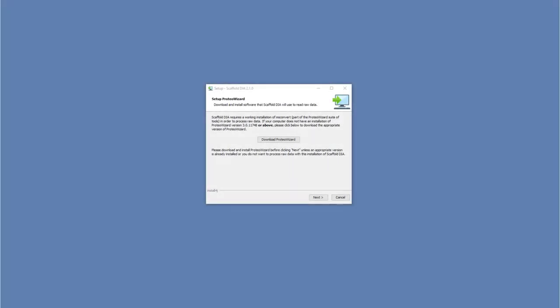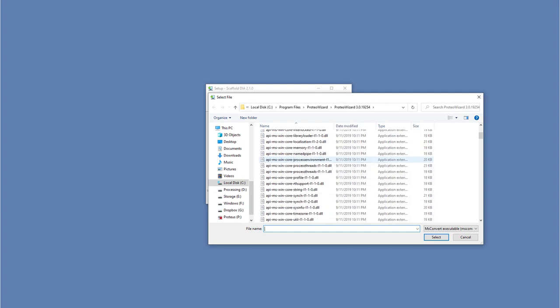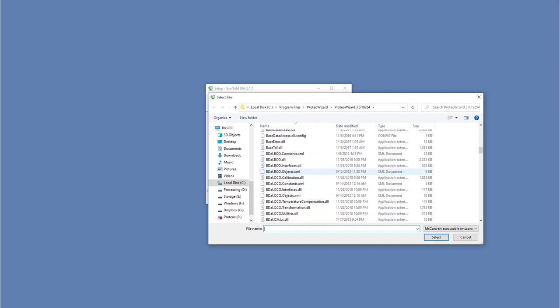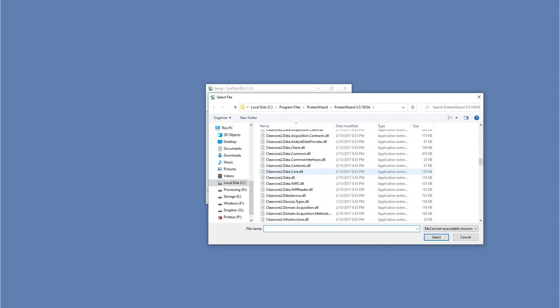If not pre-populated, point Scaffold DIA to the msconvert.exe using the file browser. This can be found in the ProteoWizard folder on your computer's C drive.